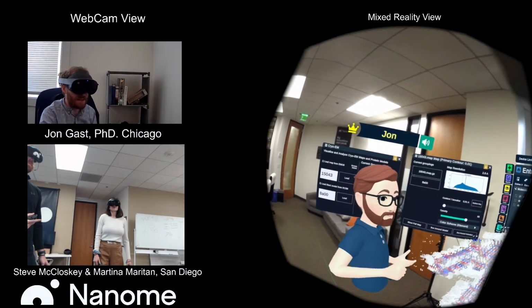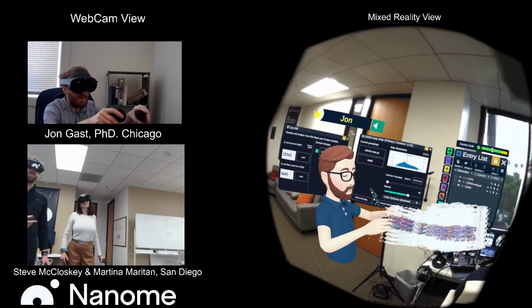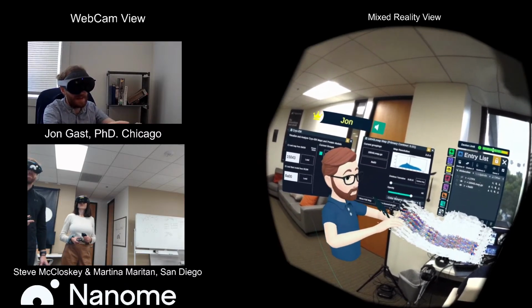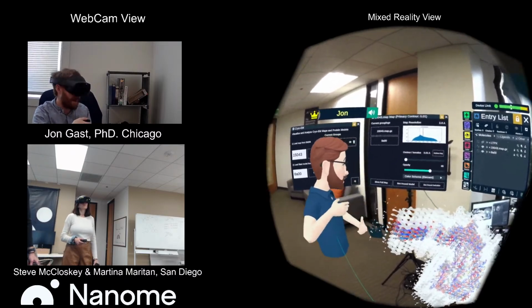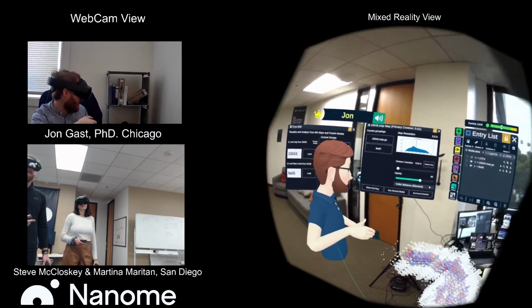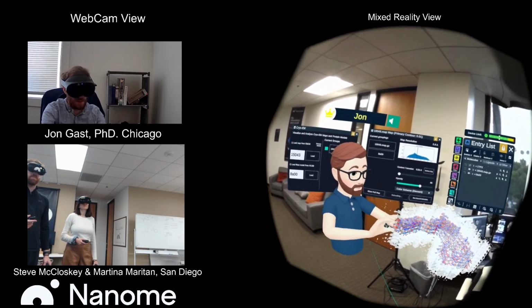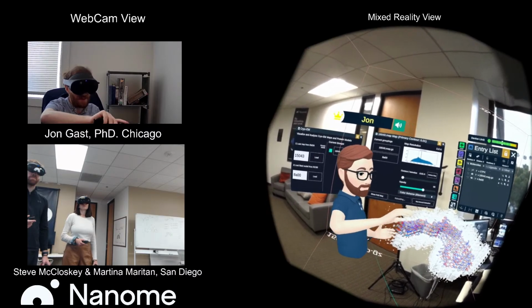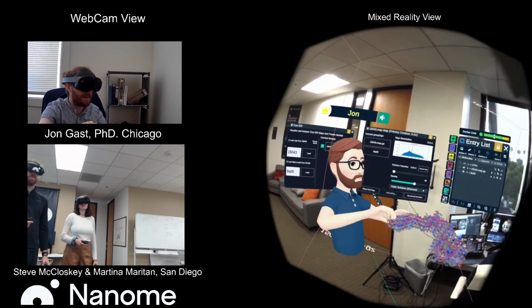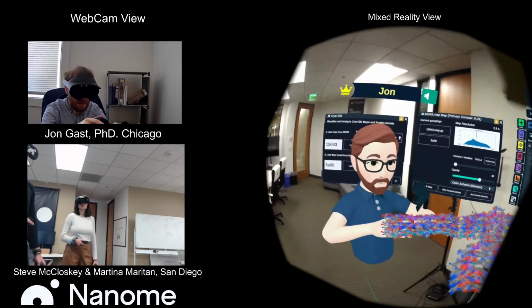And so we're going to do a few things to clean up the structure for us to take a bit of a look, because right now we have a lot of the map that isn't filled by the asymmetric unit that we got out of RCSB. So the first thing I like to do is use the box around model selection. And all it's really going to do is focus just on the maps that I have, things that are already filling it in. And so now I can focus right here on what I'm seeing.